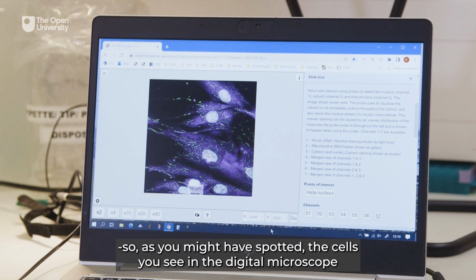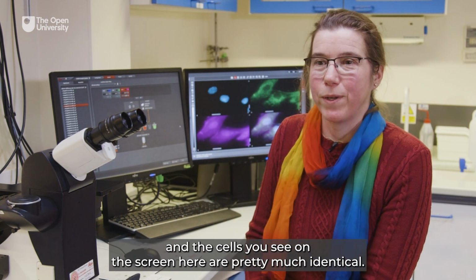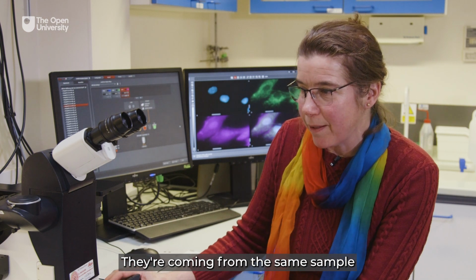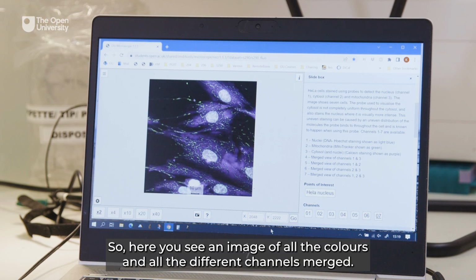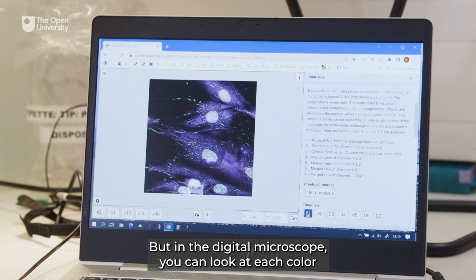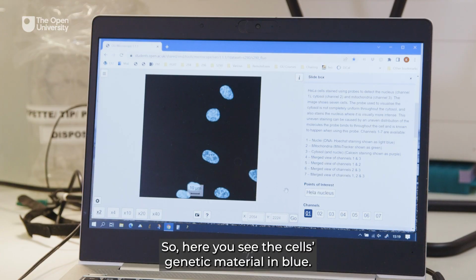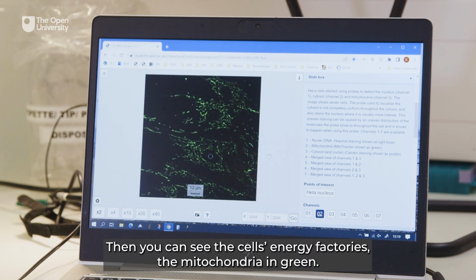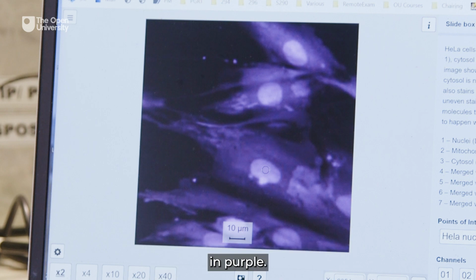As you might have spotted, the cells you see in the digital microscope and the cells you see on the screen here are pretty much identical. They're coming from the same sample, and these are the cells I used for the digital microscope. So here you see an image of all the colors and all the different channels merged. But in the digital microscope, you can look at each color individually, just like I showed you with the fluorescent microscope. Here you see the cell's genetic material in blue. Then you can see the cell's energy factories, the mitochondria, in green. And you can see the rest of the cell, the cytoplasm and the nucleus, in purple.